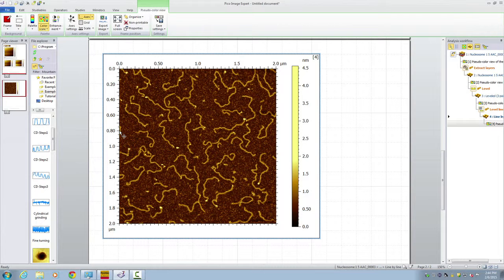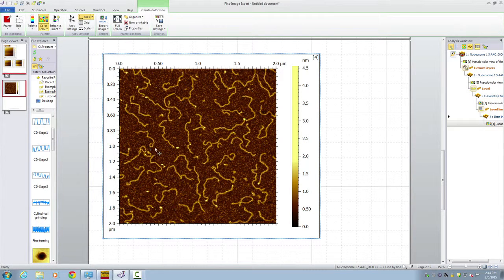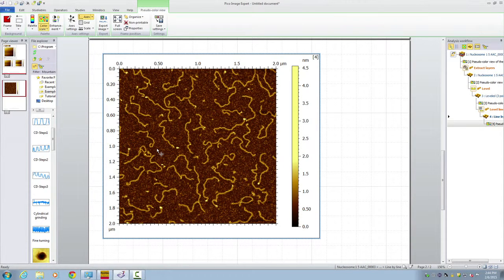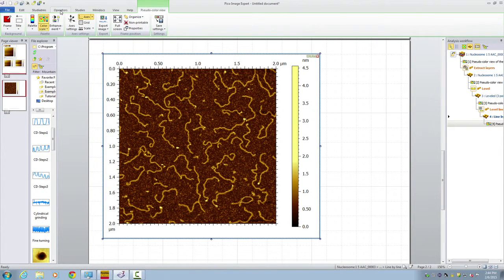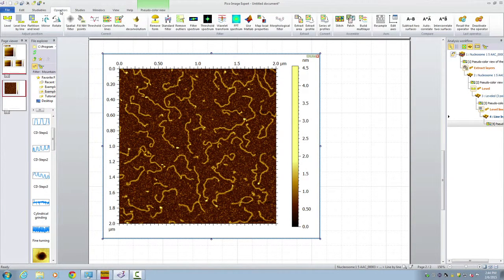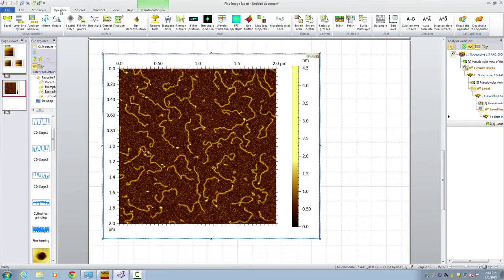The next step, let's do some filtering to remove some of the noises. Again, click on the image. Go to the operators. And in the operators, we're going to choose Spatial Filter.